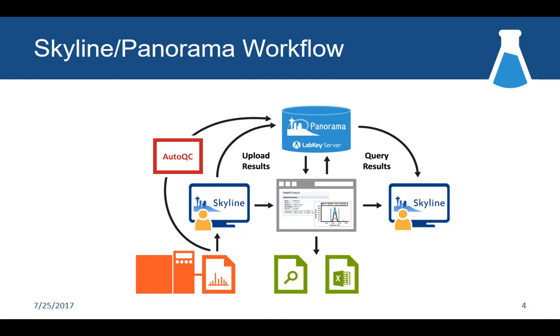So this is really convenient if you're trying to share data with people who maybe don't have Skyline, don't want to install it, or maybe they're not actually going to be editing Skyline documents or working on it with that level. You can share out a link to a collaborator or make it publicly available. So there's Panorama Public, that I think Rajesh is going to mention, which is a way to post data to support a publication. And that has been a great way for people to experimentally work with their data, build up their publication, and then just usher that out without a lot of extra steps.